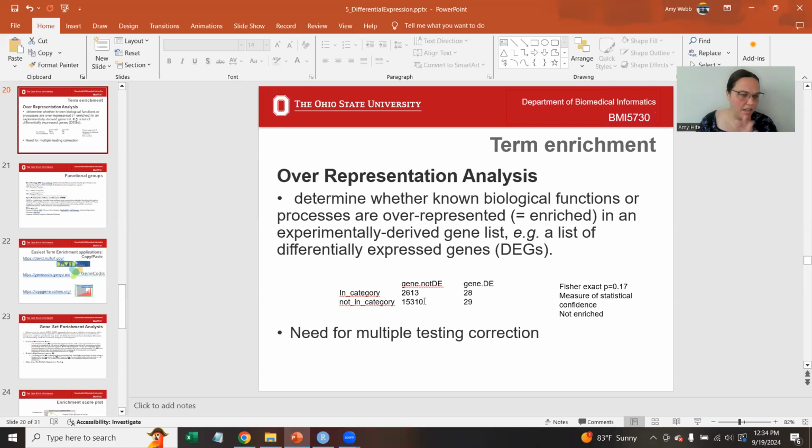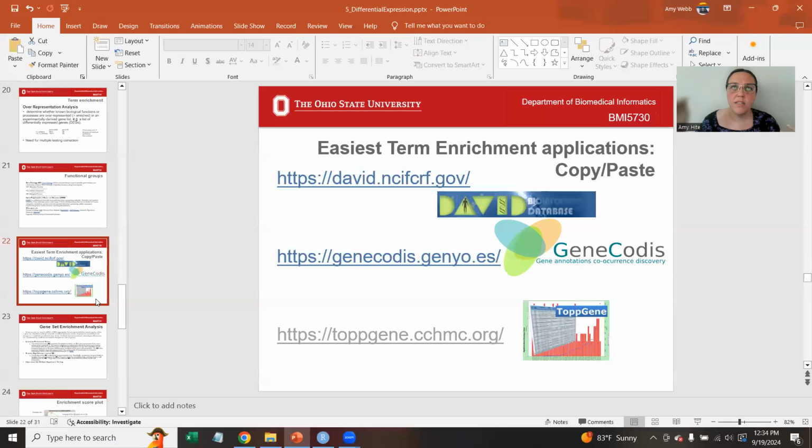That's something a lot of people just skip over when they're doing functional enrichment analysis. They don't worry about the background, but it's actually kind of important. In the functional enrichment program I use in Cluster Profiler, they call it a universe. So consider what your universe is and whether you need to correct for that or not.